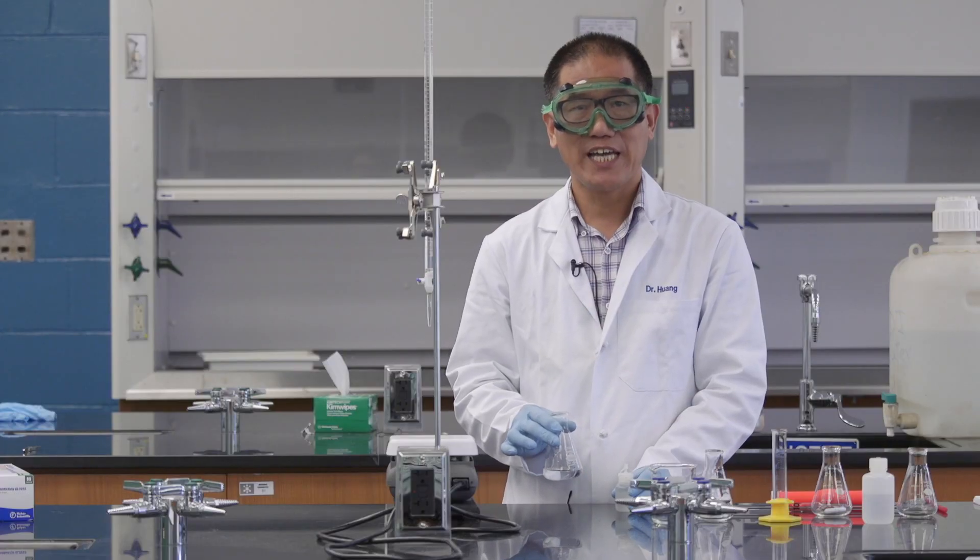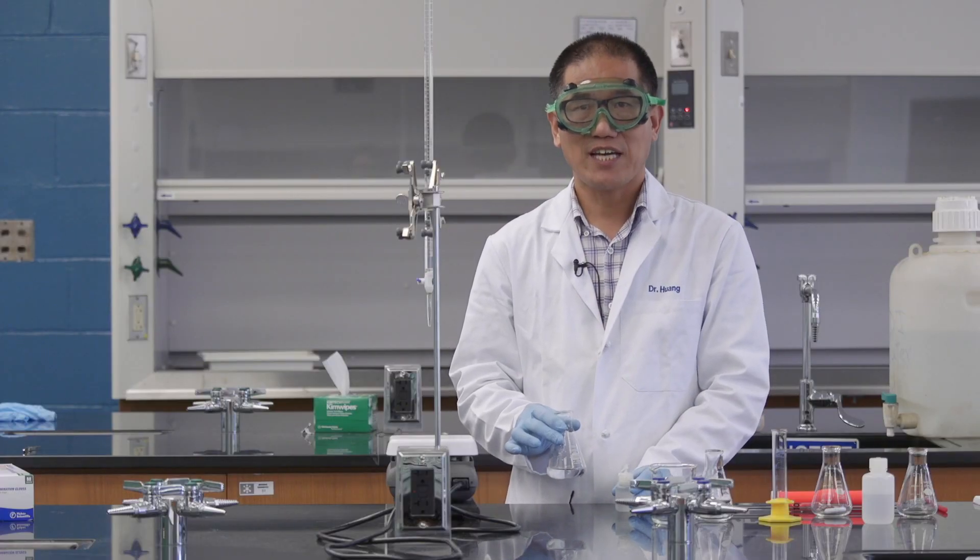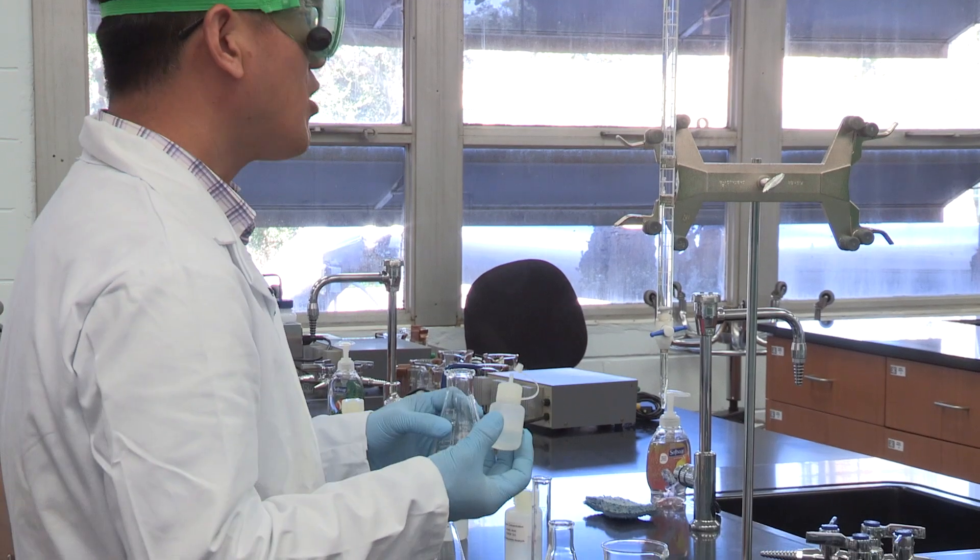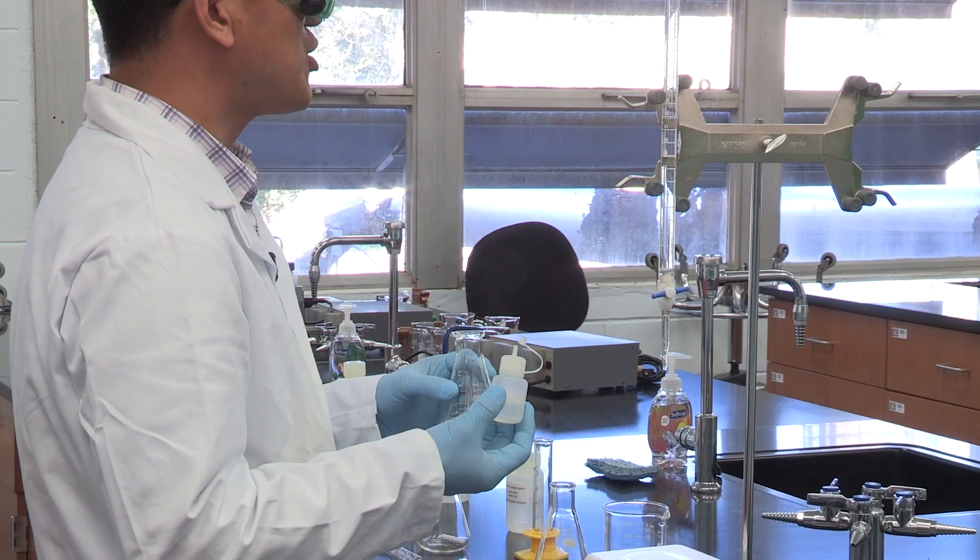After you dissolve the KHP, don't forget to add the acid-base indicator, which is in this small bottle. You only need to add about three to five drops.